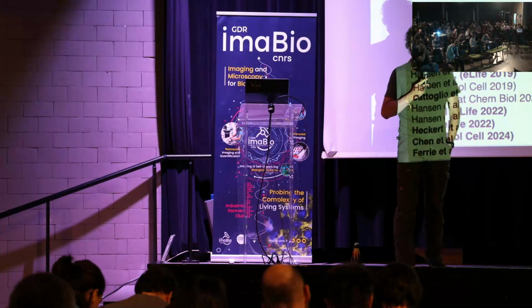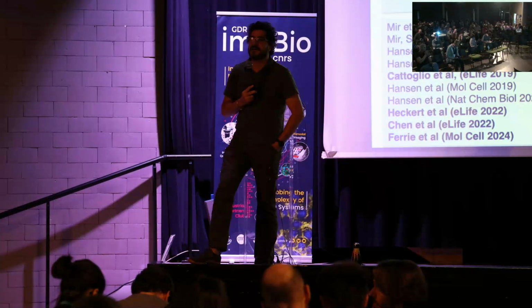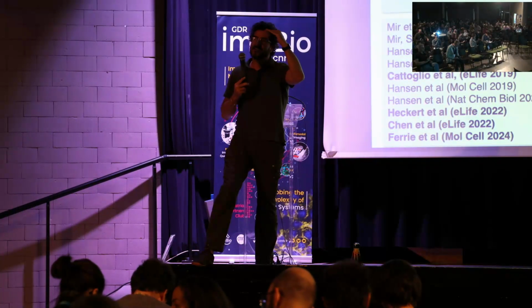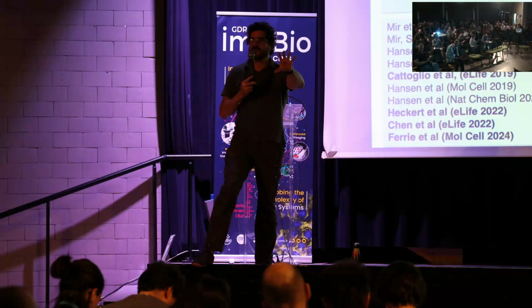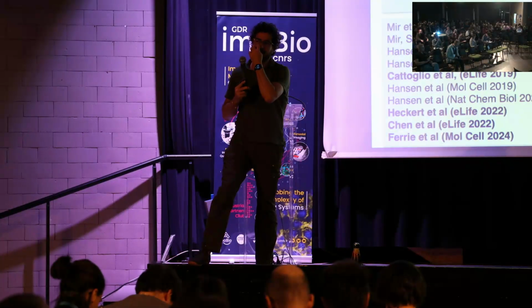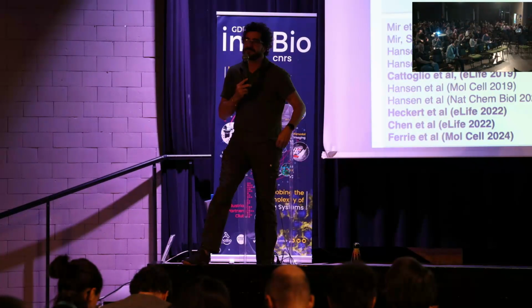So we saw this, yes, it works with violet dyes. The thing is, so far, we are using the violet direct reactivation for a control. We like to have the opportunity to directly bring the dye from the dark state, because it gives us the ideal control to see what is dependent on the proximity of the other molecule and what is independent of the proximity of the other molecule. This is what we get in between the UV and the green light. Okay. And so I think we would lose that if we go to the blue for the donor.